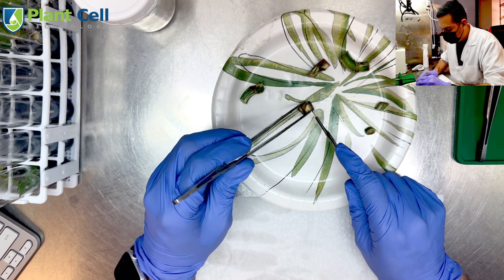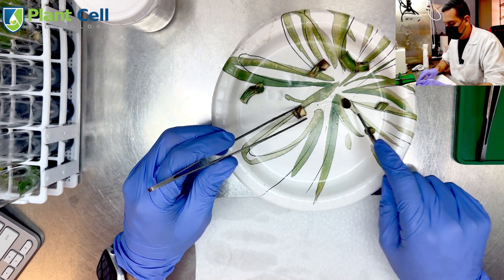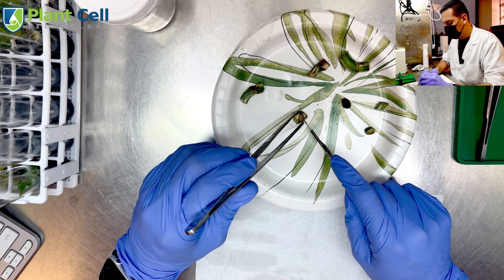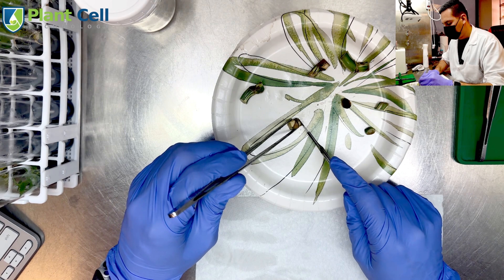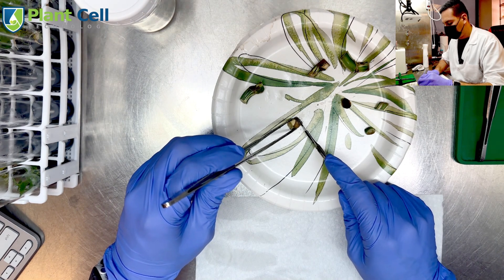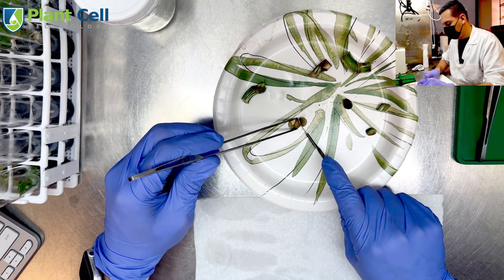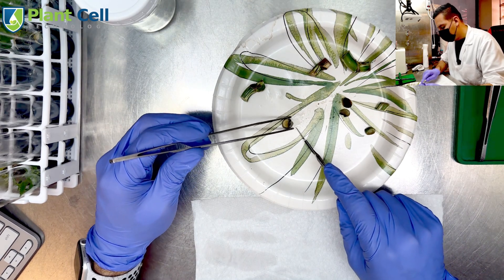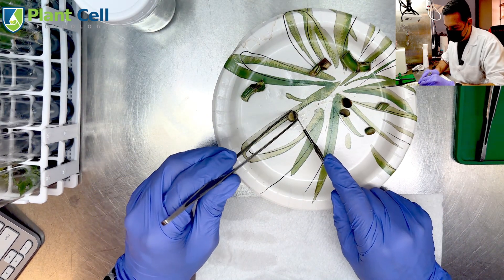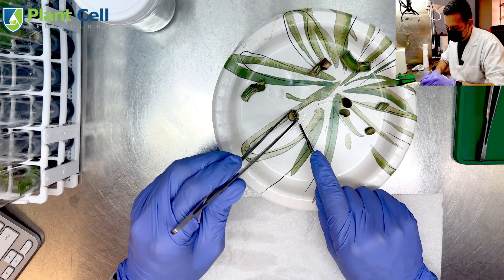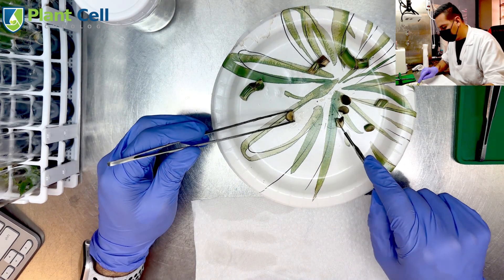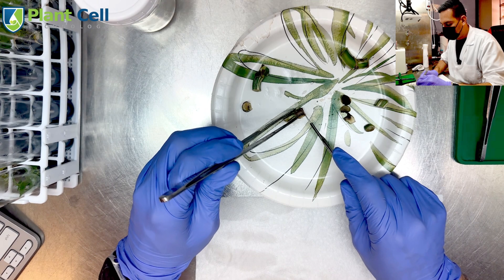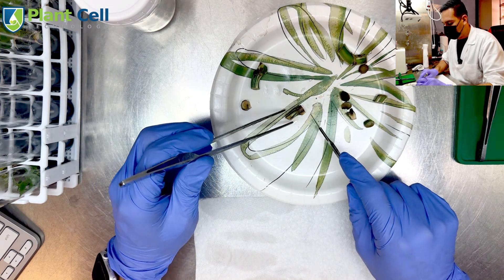This one as well, I'm going to do the same thing. I'm going to cut from both sides where the plant was exposed to the bleach. This helps to prevent some of the phenols coming into the media. Although I already know I'm going to have some phenol problems with this plant, my media has some charcoal that's going to help absorb those phenols.